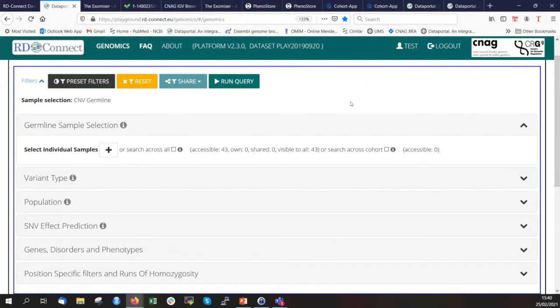We are indeed doing that now. All the data is now done with version 37 of the genome, and if I'm not mistaken, GATK 3.6. And now we are running all the data with version 38 and GATK 4 point something. So yes, we are rerunning all the data. What we do update more often than that are the annotations of the data and the databases in the system. So even though the calling was done some time ago, the annotation is still updated.